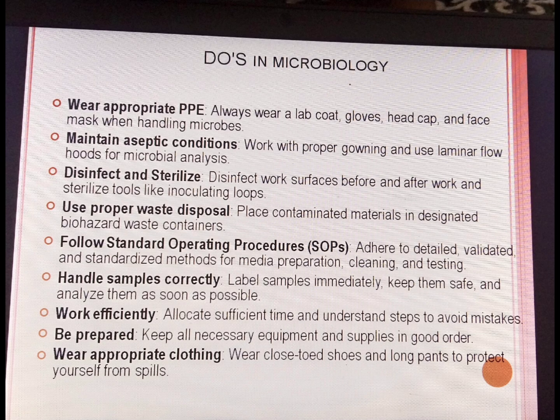Do's in the microbiology lab. Wear appropriate PPEs. Always wear a lab coat, gloves, head cap, and face mask when handling microbial activity. Maintain aseptic conditions. Work with proper gowning and use a laminar flow hood for microbial analysis. Disinfect and sterilize. Disinfect work surfaces before and after work, and sterilize tools like inoculating loops.